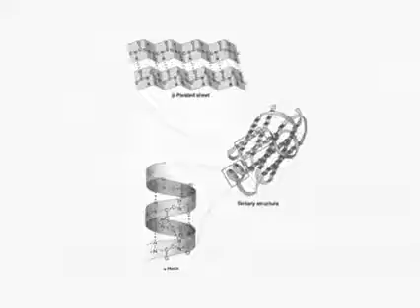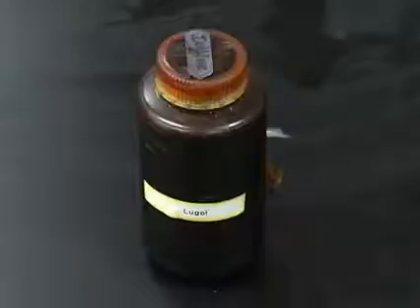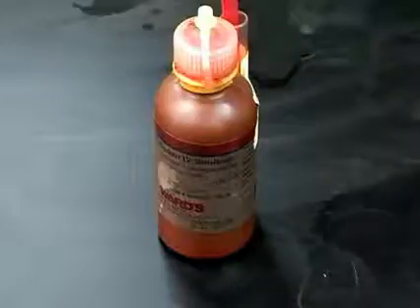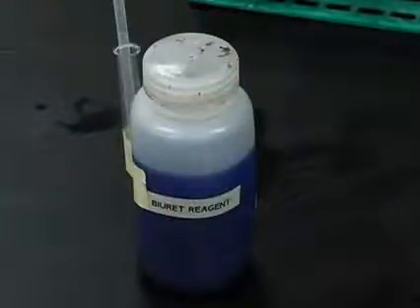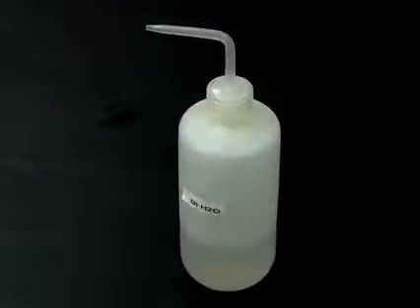We will be using the following tests for the detection of these molecules: Benedict's test for simple sugars, Lugol's test for starch, uncoated paper test and Sudan-4 test for lipids, and Biuret reagent to test for proteins. For each test, we will use DI water because we know it is pure and does not contain carbohydrates, lipids, or proteins. Because it does not contain any of these macromolecules, it will not react with any of the chemicals used for testing and will thus produce a negative result.